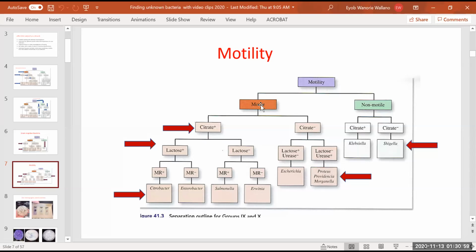Scientifically, when we say all bacteria can move, it is by theory. But we are going to know bacteria are motile because of their own flagellum. Now we identify them by wet mount, and the other one is by stabbing, gel stabbing. Very interesting now. I am not going to ask you on the test about wet mount on a slide, concave slide or hanging drop type. I don't ask you, but I may ask you about stabbing.